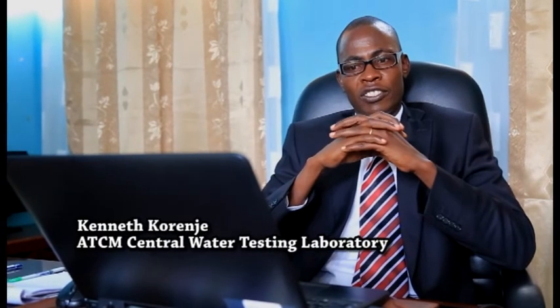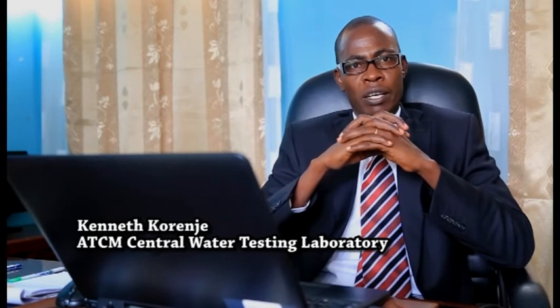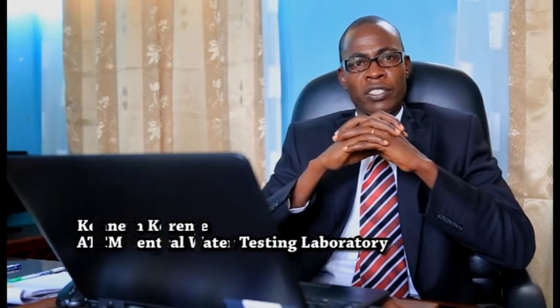Now, who are our customers? The laboratory was set up to help the citizenry in knowing the quality of their water. So as a lab, we help the Water Resources Management Authority to fulfill its mandate in ensuring that water resources are protected in terms of quantity and quality. So our first customer is the Water Resources Management Authority.